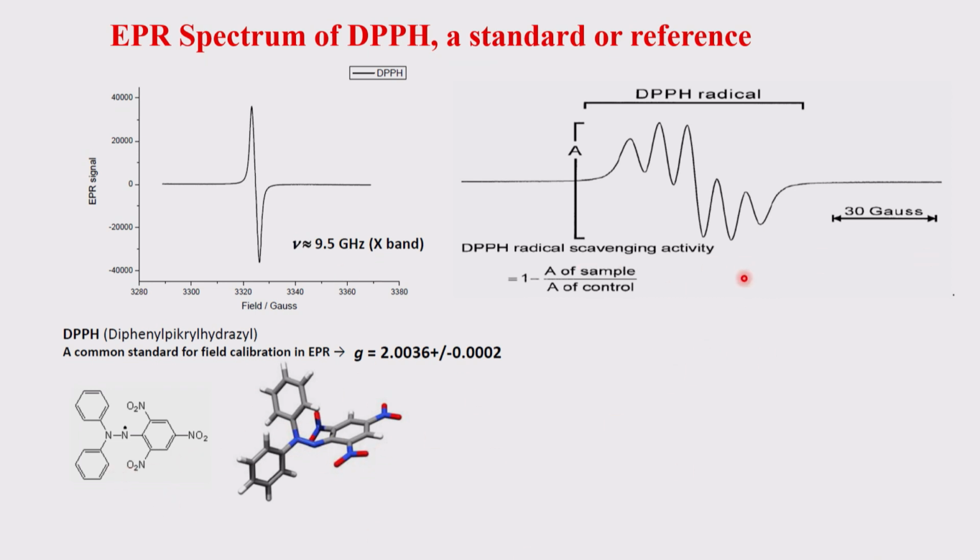So you can get the isotropic spectrum for this, and when you have an anisotropic environment, you can get all of these as well, and their coupling. This electron can be here, this electron can be here. So you can get the corresponding 5 lines, 1, 2, 3, 4, 5 lines.